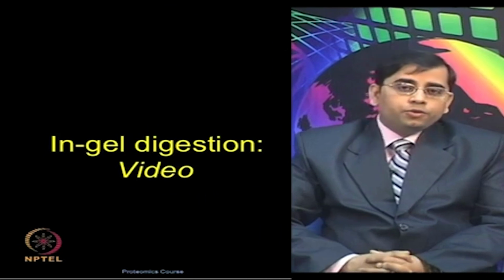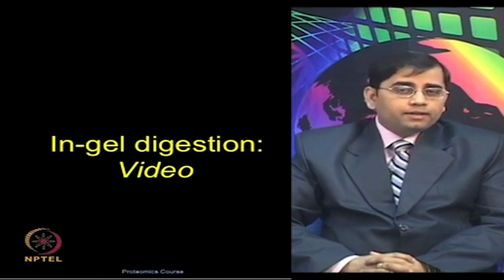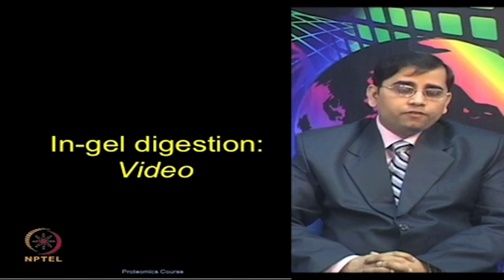The following video which we are going to watch is going to provide the broad guideline for the in-gel digestion. However, the recipe is very flexible and it varies from lab to lab to meet the specific requirements of a particular proteomic experiment. The in-gel digestion procedure is compatible with downstream mass spectrometry analysis, whether you want to continue with MALDI-TOF or you want to do LC-MS based mass spectrometry analysis.